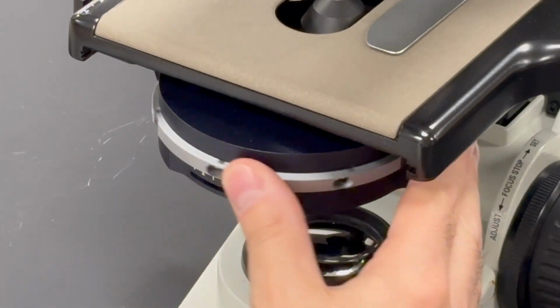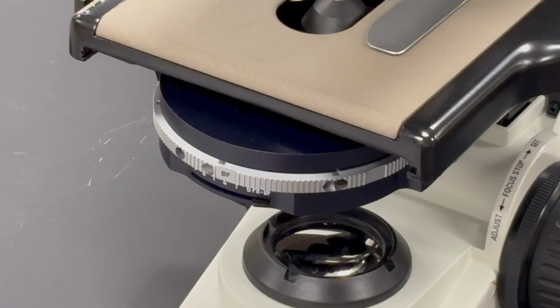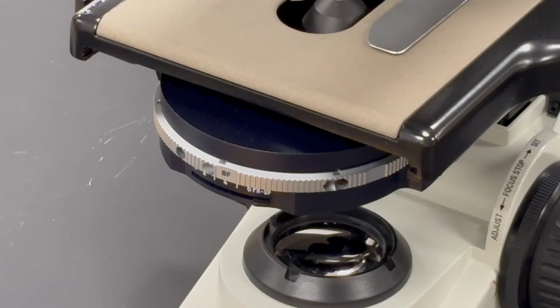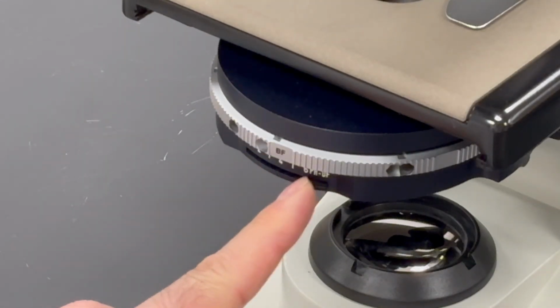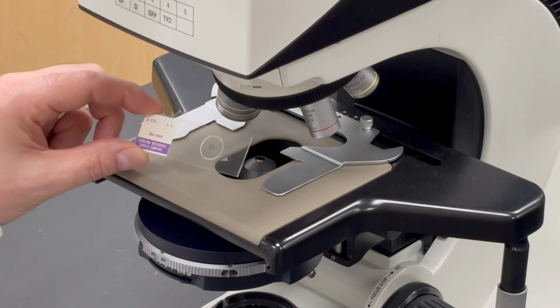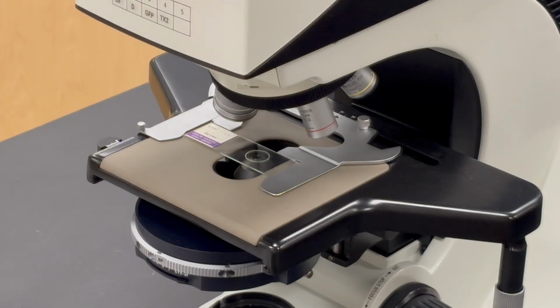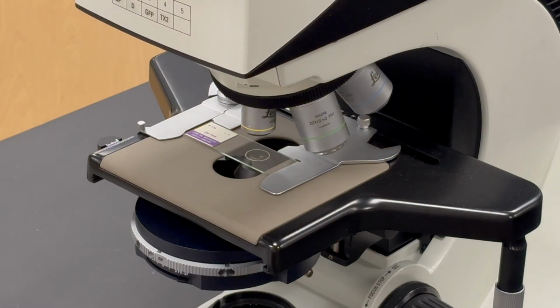Rotate the condenser filter turret to the position with the appropriate condenser component for either bright field, dark field, or phase contrast microscopy. Ensure that the condenser aperture diaphragm is wide open. Place your specimen in the slide holder calipers on the stage. Rotate the objective lens turret, placing the 10x objective lens into the optical light path.